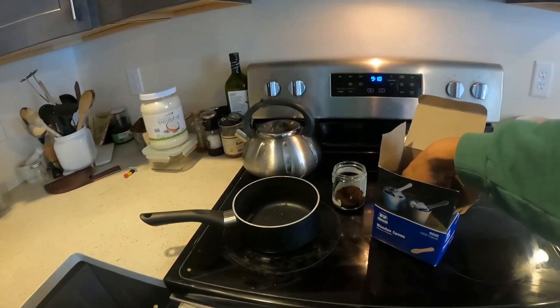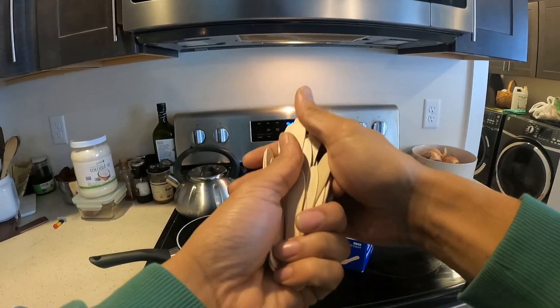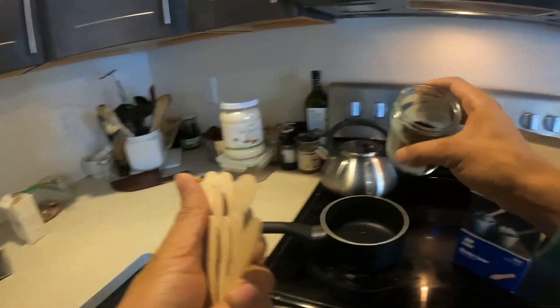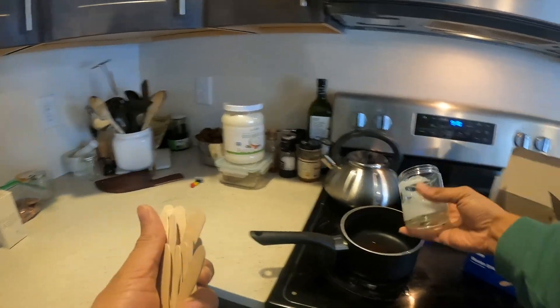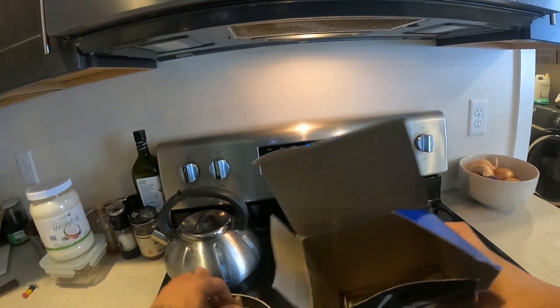When I do wooden dowel spawn — plug spawn for growing mushrooms on logs — I like to soak the wooden dowels in coffee. This adds nutrition to the mix. So I'm going to put this coffee in here and drop these wooden spoons into this pot.